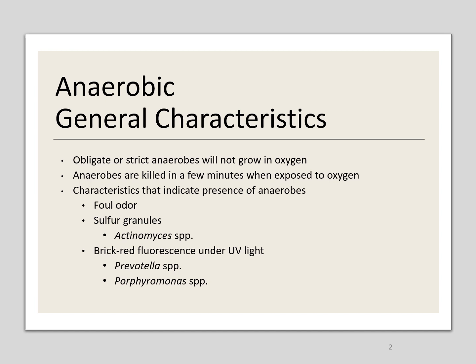And of course, if you're looking at the organism on an agar plate and it fluoresces, then that's an indicator that it is an anaerobic pathogen.